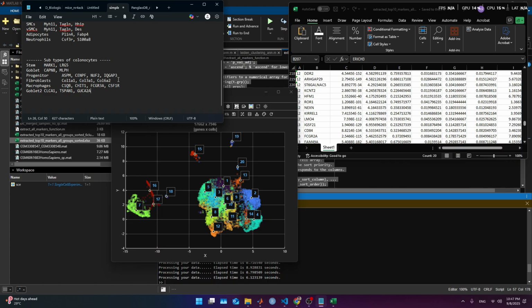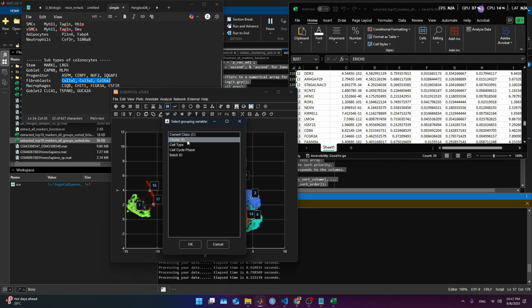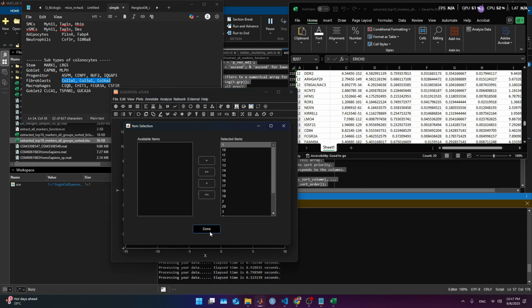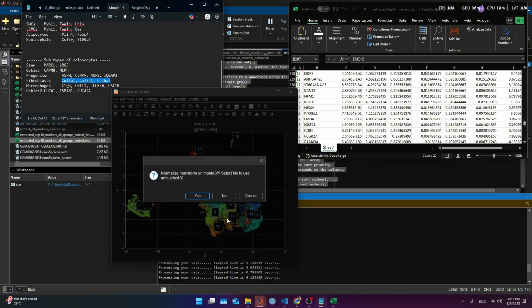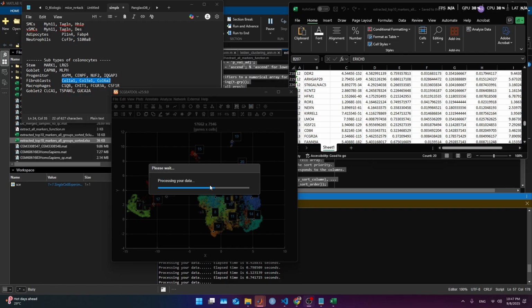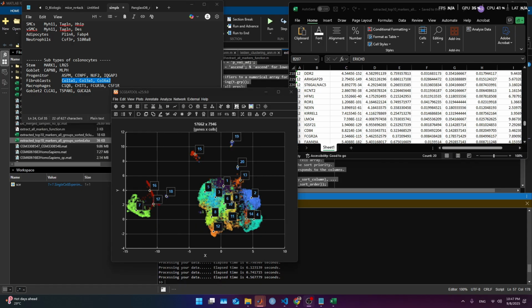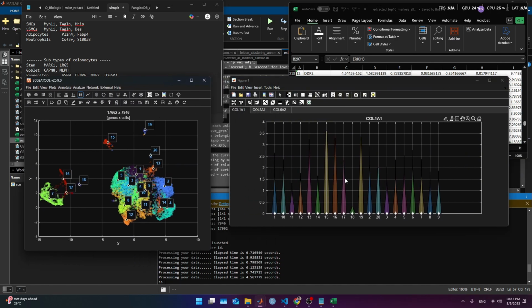Now, we're going to look for fibroblasts. We had two populations before. Now we have to figure out if we have it again. So Violin, cluster ID, done, gene expression, paste, normalize A and B. It's going to take a few seconds. And we get it. And let's see what is lighting up.